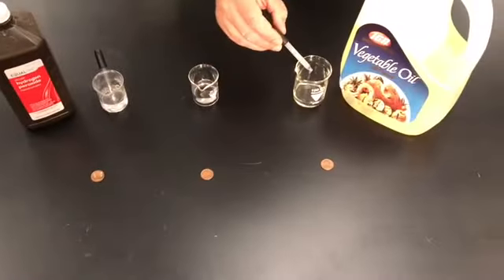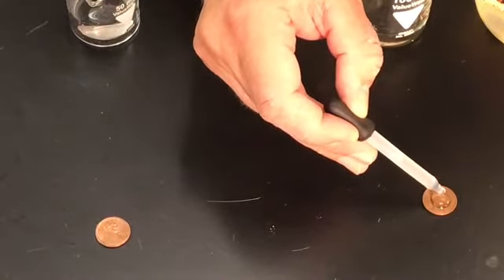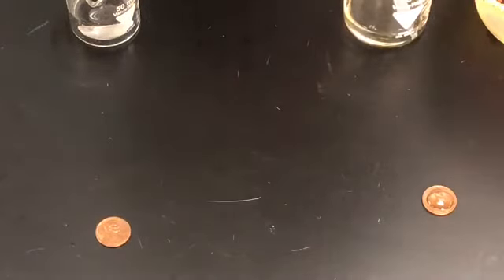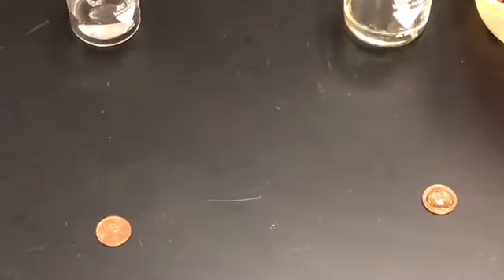All right, I'm going to do the same thing with oil here. I'm going to start adding these drops. 1, 2, 3, 4, 5. And you can see we've still got our drop of oil on the penny. We're going to keep adding drops until we spill over the edge.